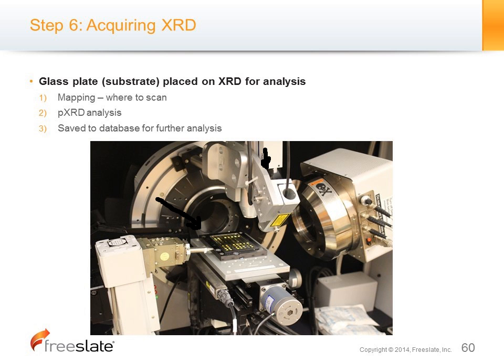So the step here is twofold. All the solid on the plate will be mapped, so the operator can see each individual well on the plate, and it depends on where the solid is, because the solid can be deposited in a ring form, completely cover the whole well, or be at the center. So you really don't know for each individual well where the solid is. So you cannot really just say scan the center of each well. That means you're going to miss most of the solid that's been formed.